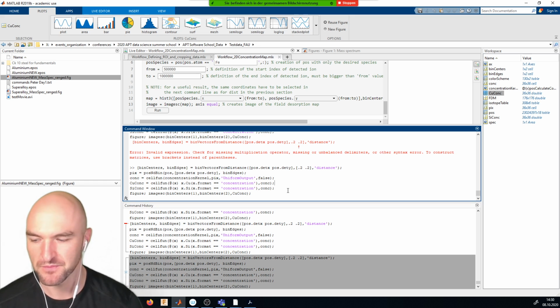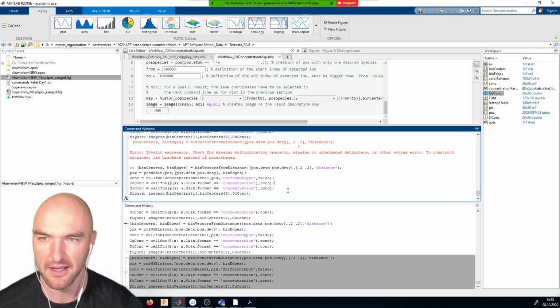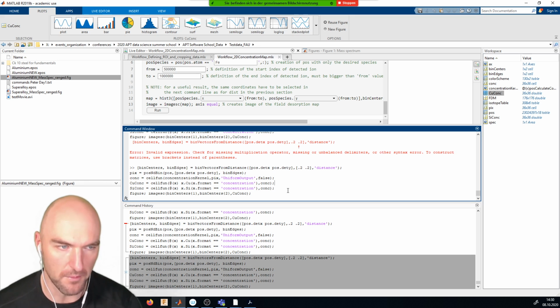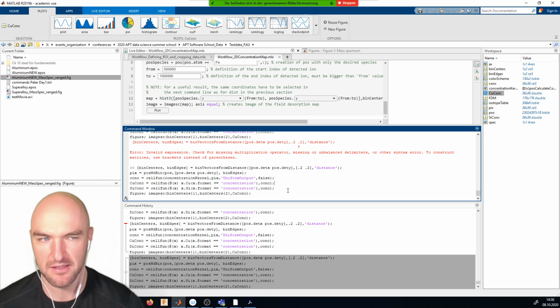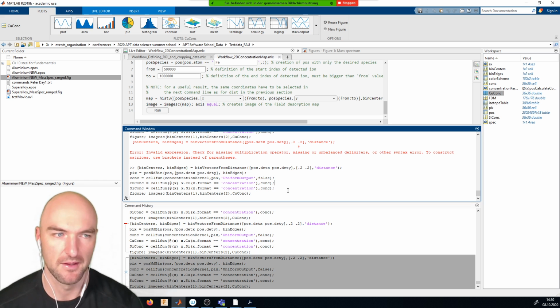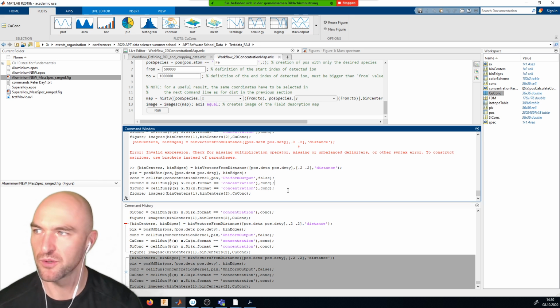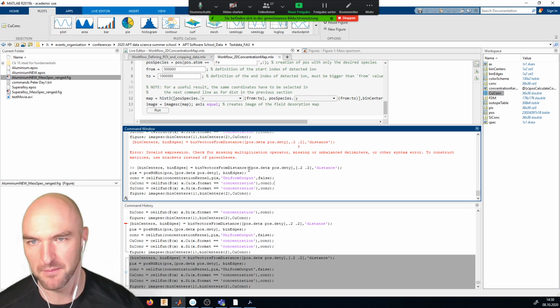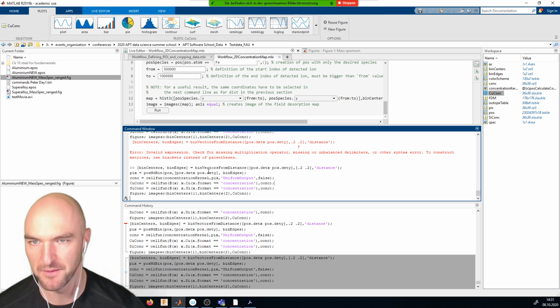But you can also go and calculate things like distance to a point, distance to a line, distance from a mesh, and this is essentially what a proxygram is. Distance to a plane, we give you all those different distance functions, and you can use those distance functions and then go and plug them into the bin vector from distance function and the pos-nd bin function. And then you can come up with all kinds.